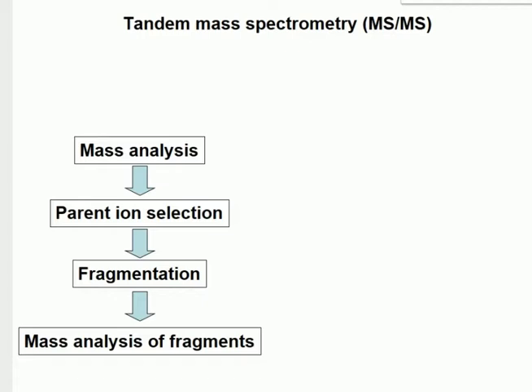And that's really what you're after when you're doing proteomics, because we need to be able to work out what is the sequence of that peptide. Okay? So we need to get some structural information. And I'm talking about primary sequence, a chemical structure, rather than a 3D secondary, tertiary structure that you would associate with proteins. So we want to find out what the primary sequence is.